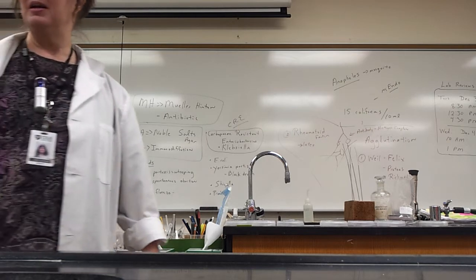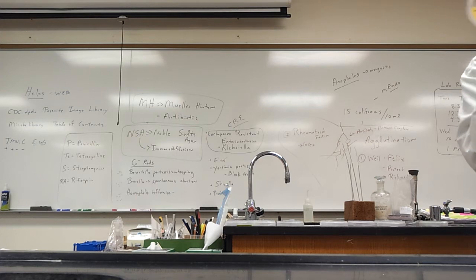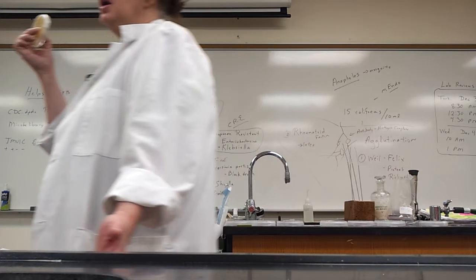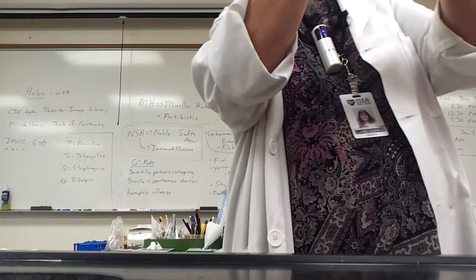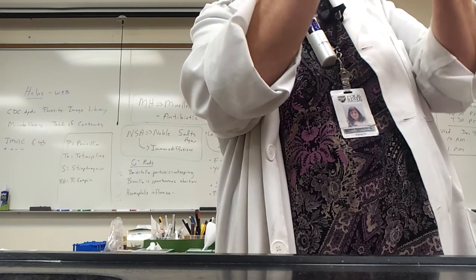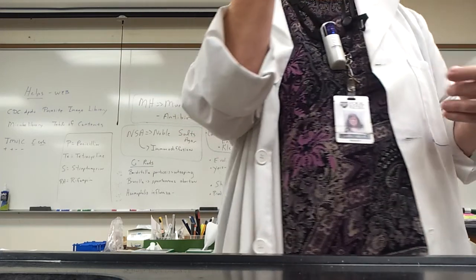So for antiseptics, and I'm going to correct this on your lab review sheet, it would still give you pretty much the same number because there's only a difference of about 1.5 millimeters. Measure from the edge of the paper disc out to the end. Even if you follow the review sheet and measure from the center of the disc out to the end, you're still going to be in my window of measurements for zone of inhibition. Measure from the edge of the disc out to the end of the zone of inhibition for antiseptics. These antiseptics happen to be Scope, Listerine, and others.